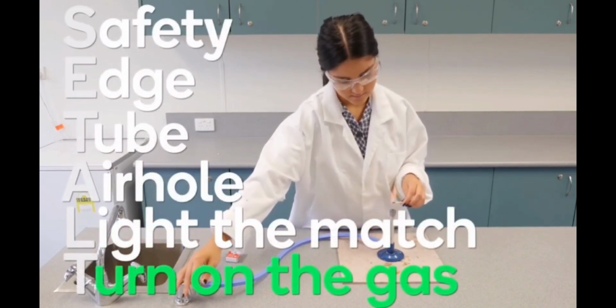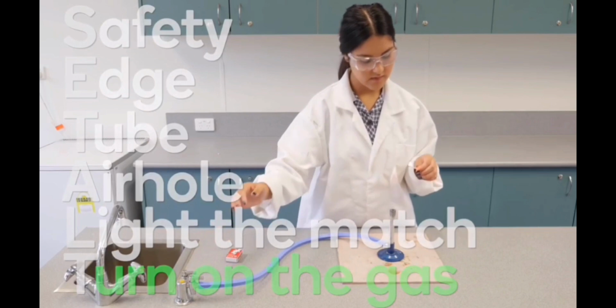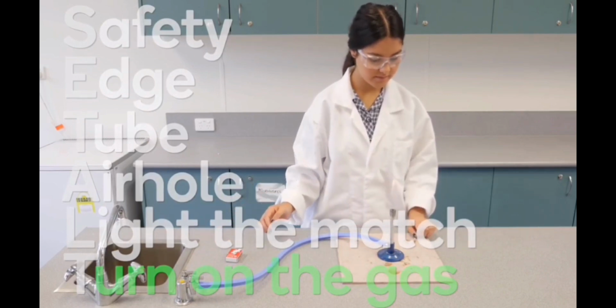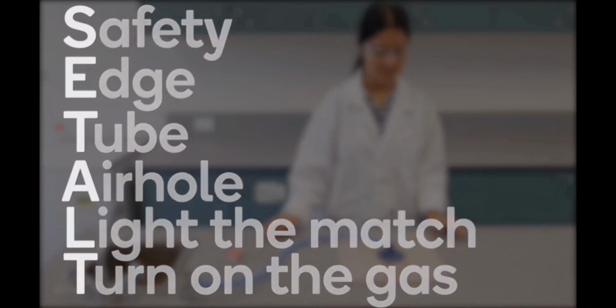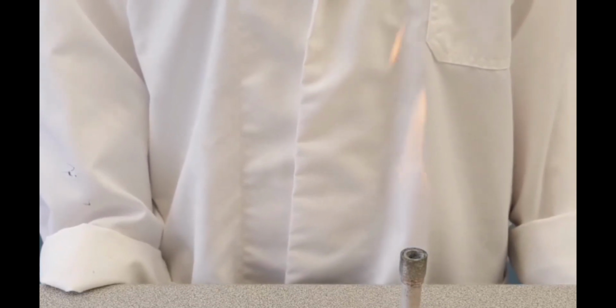Finally, you can turn on the gas. It's important to light the match first to avoid releasing dangerous gas into the air. You should always follow these 6 steps when lighting a Bunsen burner. Now you've successfully lit the Bunsen burner, you should begin with a bright yellow flame.